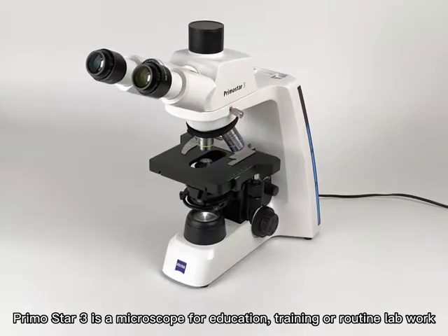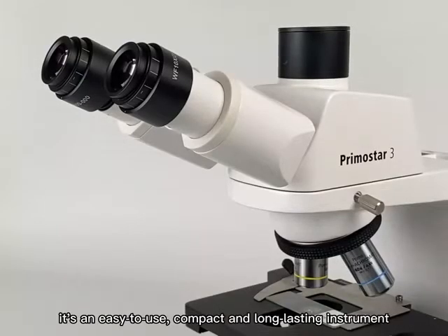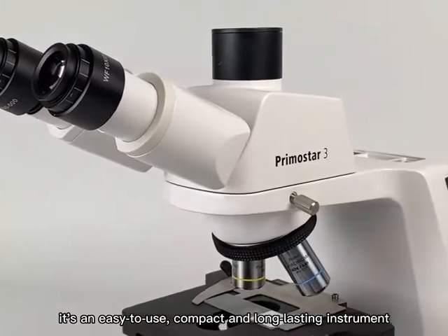PrimoStar 3 is a microscope for education, training, or routine lab work. It's an easy-to-use, compact and long-lasting instrument.